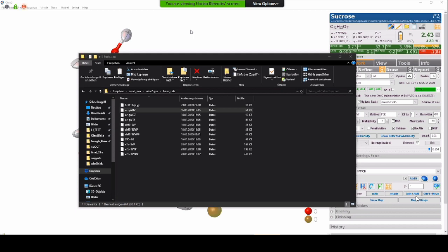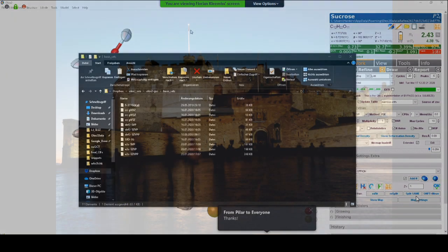Is there a resolution limit? I mean, what data do you need to use this kind of refinement? I think I commented on this already. Simon Grabowski actually said it very nicely: if you don't see any residual density in bonds or lone pairs, you might not see much improvement using Hirshfeld atom refinement. However, I tend to say, give it a try and see what it does.